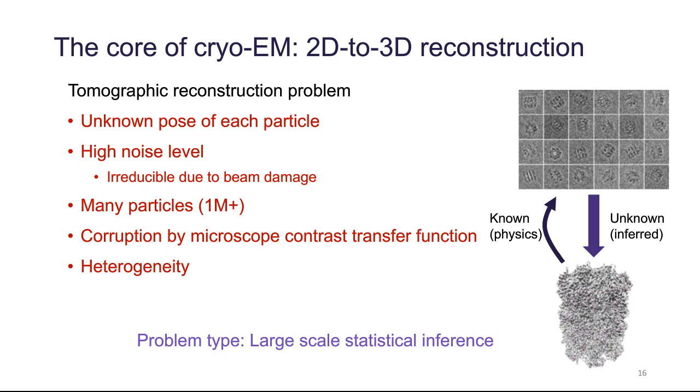The algorithm that can actually be used to answer this question is known as iterative refinement. I'm going to explain this algorithm in detail because for anyone who will be using CryoEM for any purpose, understanding this algorithm and its characteristics provides all the insight for why results might be good or bad, where things can go wrong, and where there are areas for improvement. The algorithm involves two steps.